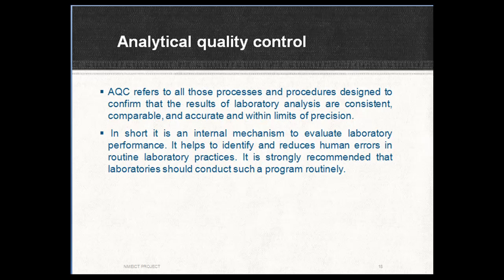In short, it is an internal mechanism to evaluate laboratory performance. It helps to identify and reduce human errors in routine laboratory practices. It is strongly recommended that laboratories should conduct such programs routinely.